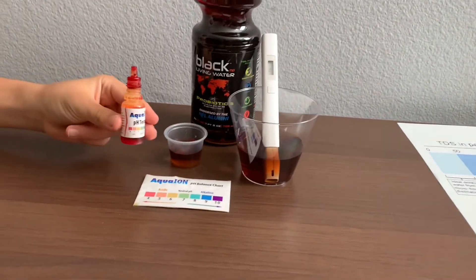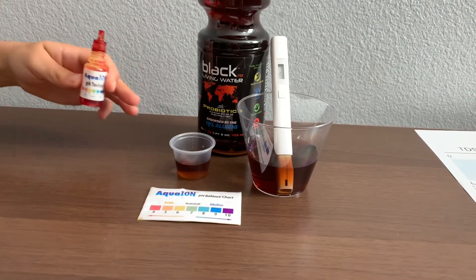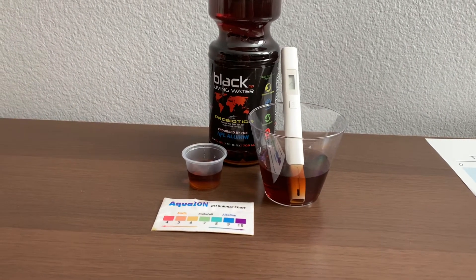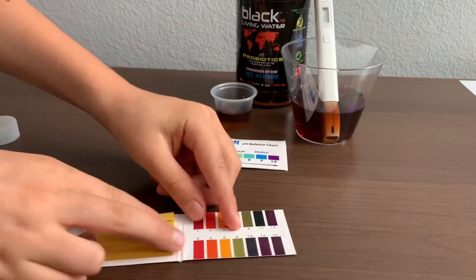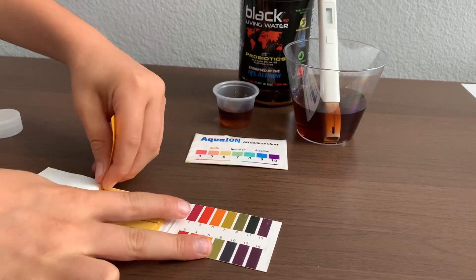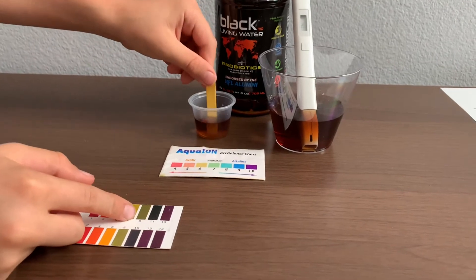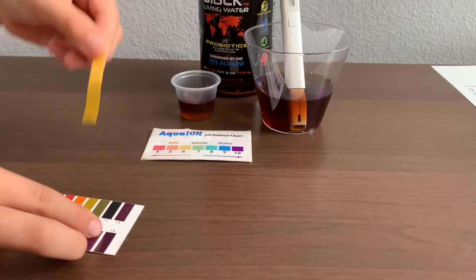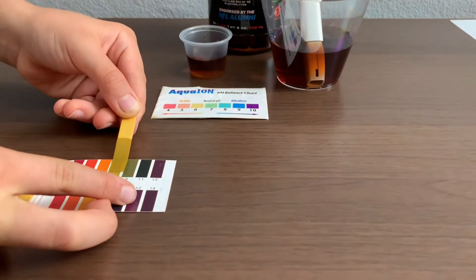Now, let's test the pH level. We aren't going to use this one because this is a different color — this won't work. We have to use one of these strips for our pH levels. Let's take one out and dip it in halfway. Now let's take it out and if I can match these up correctly, I would say this is a seven.